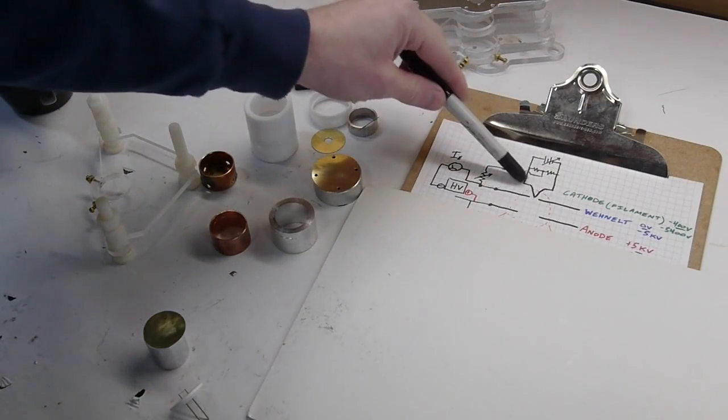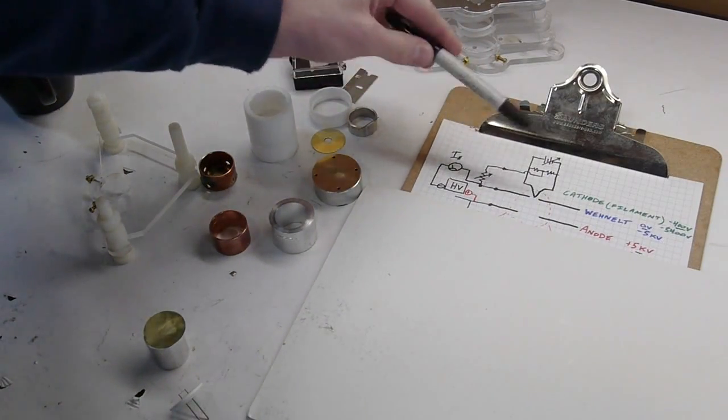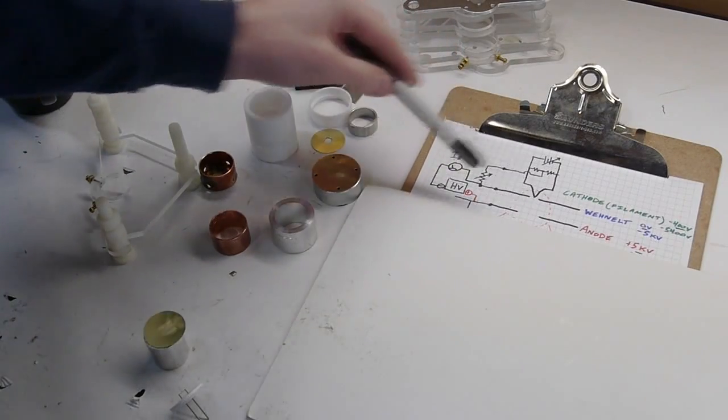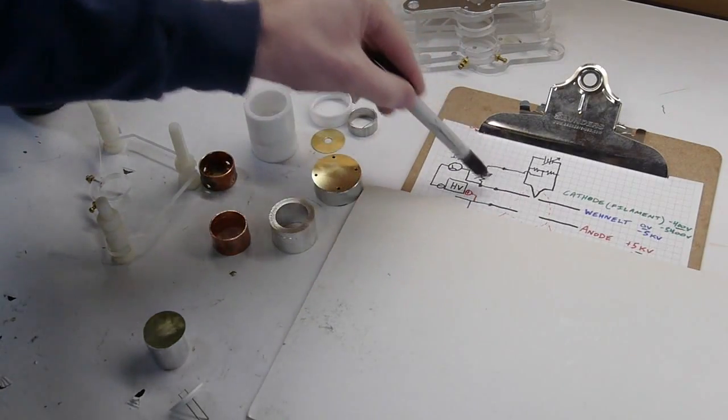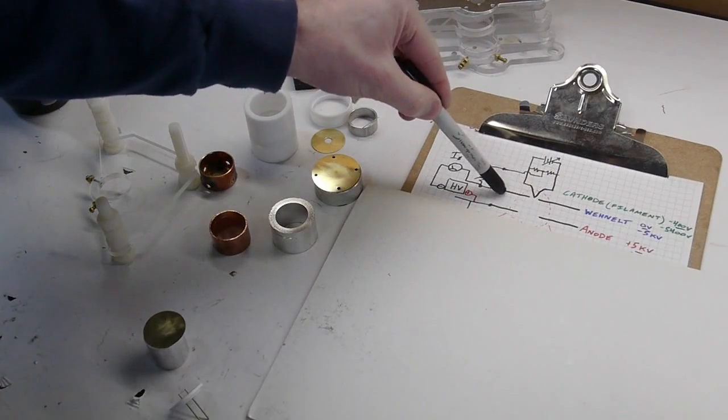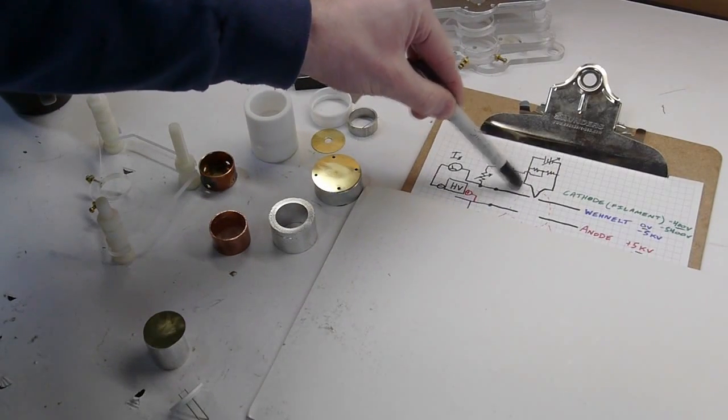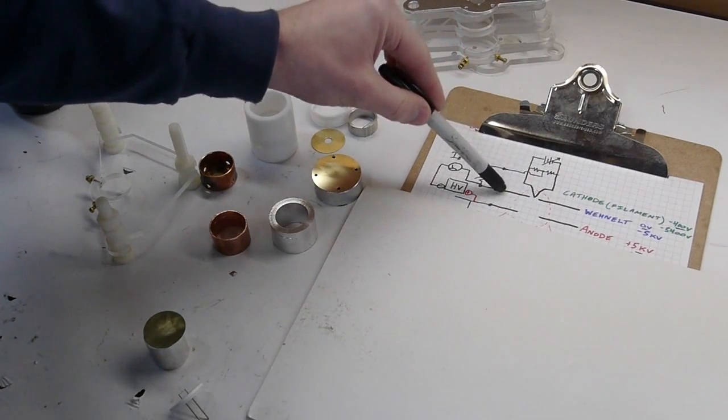Then there is a metal plate with a hole and this is known as the Wenelt cylinder, could also be thought of as a grid, and then below that there is the anode.